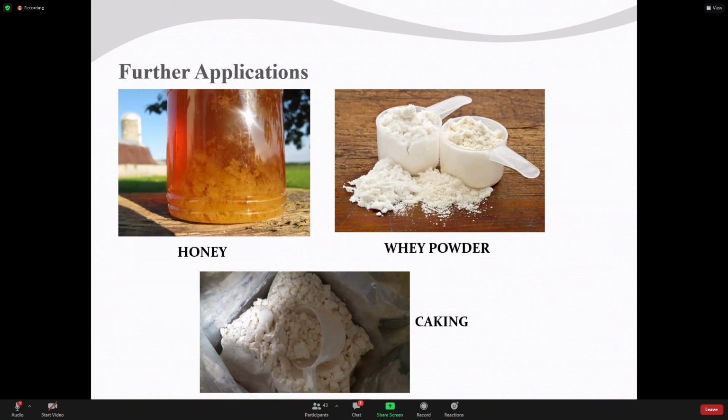Okay, I went very fast on this application session, but this was just to show how time domain NMR can be used for different food applications, and we can generate many more. And in SuChAQuality, we will also be developing new ways, maybe solving new problems in the confectionery sector, and maybe also on other food materials.